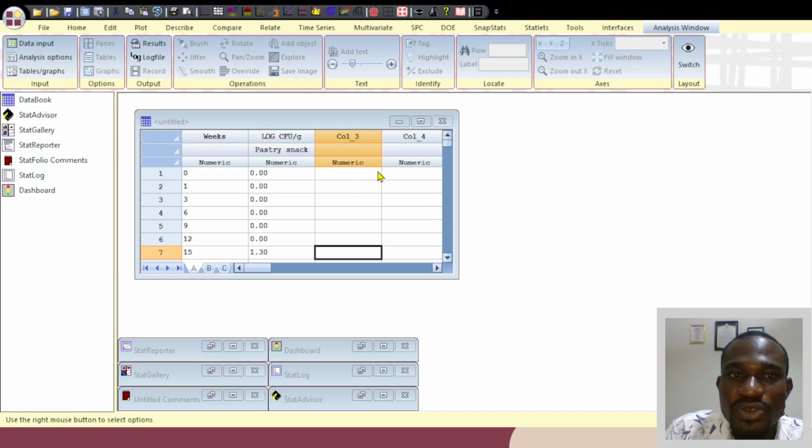Over here, you have to identify the percentile you are choosing. And so there is also a theory behind this. Normally, in some research papers I have seen, the 90 percentile is used. So that is to say that if nothing at all, 90% of the population should be safe in terms of your data. 10% could be given out as an error, 10% allowable error.